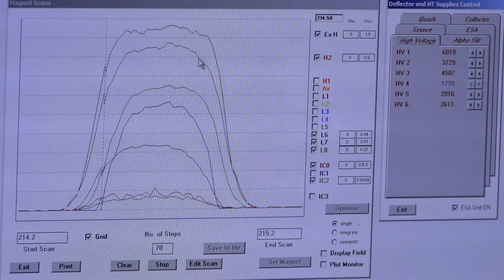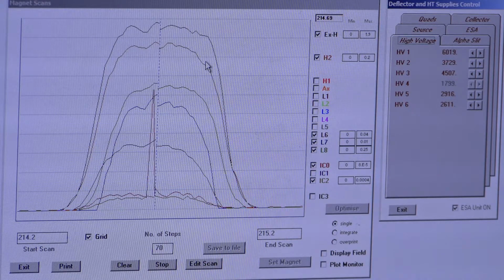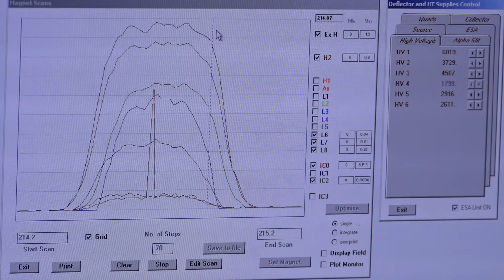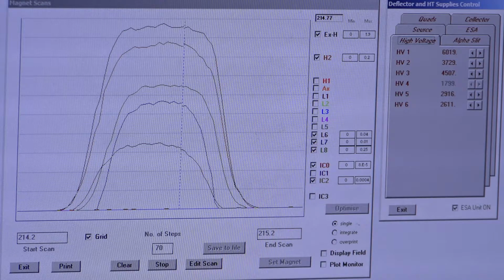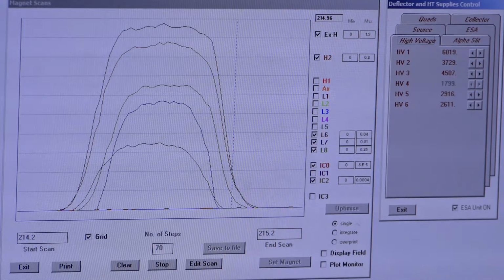Just a little note, there's this dip happening in thorium, and you may start to see it in the 238. What's happening is you're moving a little bit too far out on your slits at that point, so you're not really centering on them anymore. You're outside the range and it's clipping the signal. And that's how you know you're pushing it too far with your quads. You're pushing it too far in one direction, as you'll see with this little clipping motion. Those are good indications you've pushed things too far.